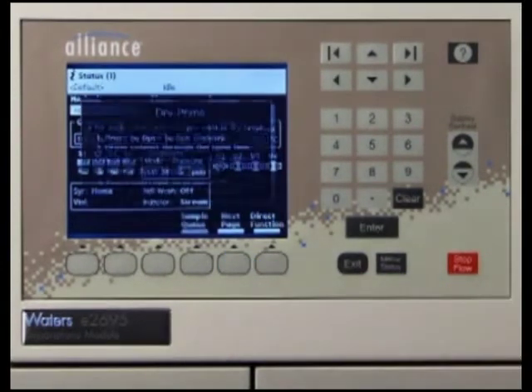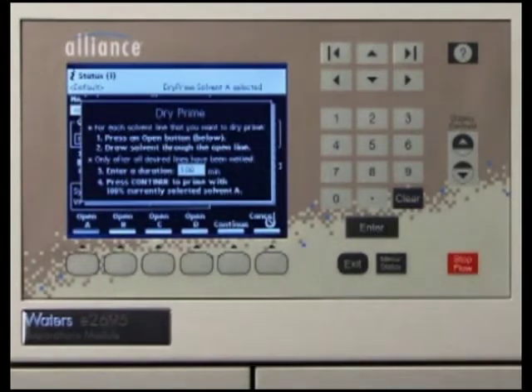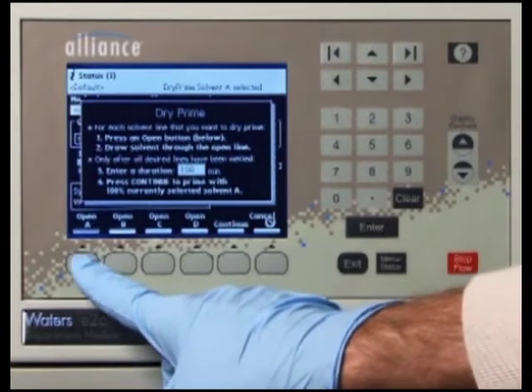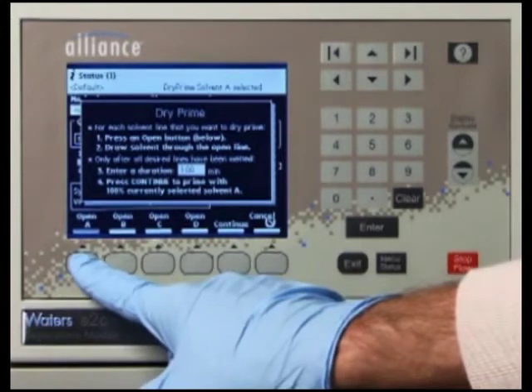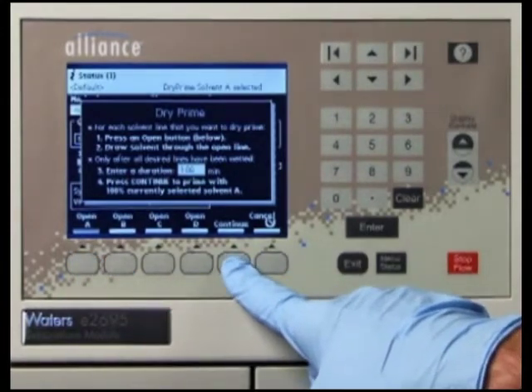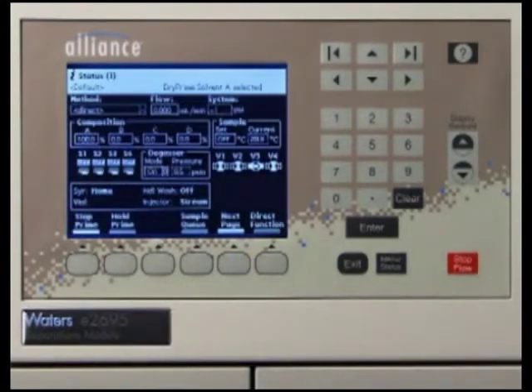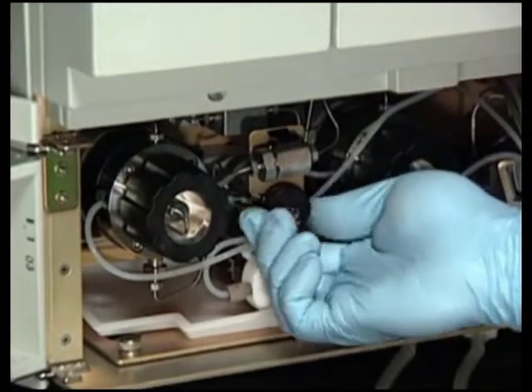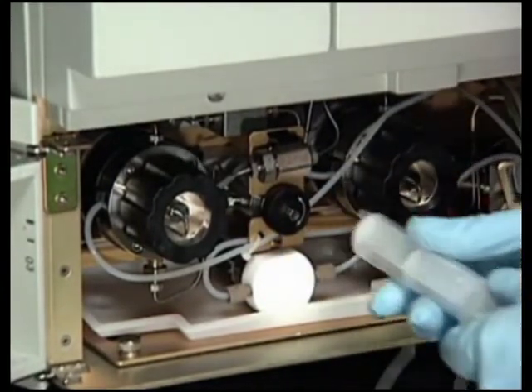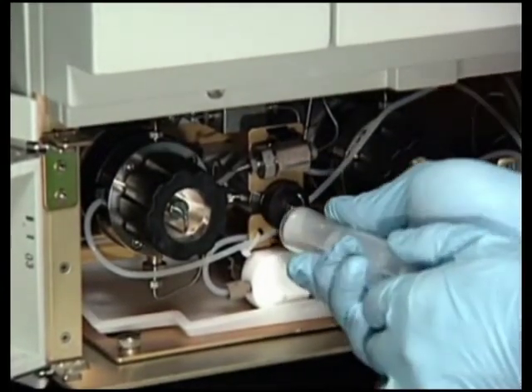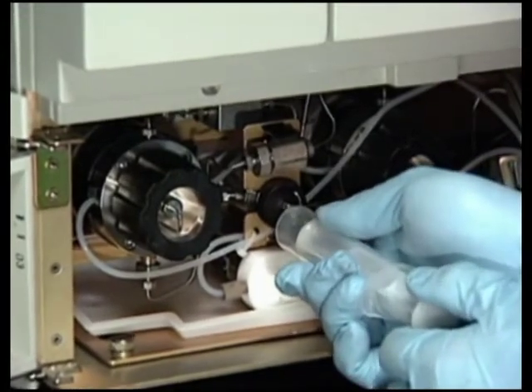The Dry Prime dialog box appears. Press the screen key corresponding to the solvent line you want to prime. Then press Continue. Next, open the vent valve and insert the priming syringe. Withdraw the syringe plunger to pull solvent through the tubing.